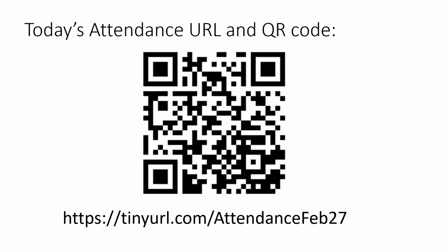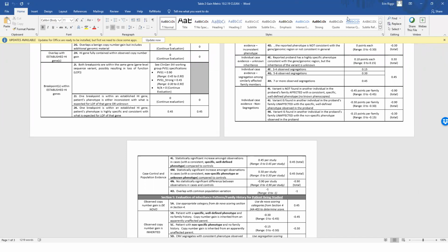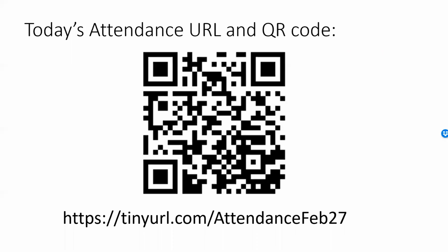Okay, next question. Someone was curious why NGS-based approaches seem to detect deletions more easily, and is this generally true? So yes, in general, it is true. It's going to depend on a number of different factors, primarily the different approaches that were used to call the variants. If you're using a read depth-based approach, it's going to perform very similar to a microarray, where if you have a deletion, you're going to see a 50% drop in your signal intensity, which is much more striking than if you have a heterozygous duplication, where you have a marginal increase in your read depth.